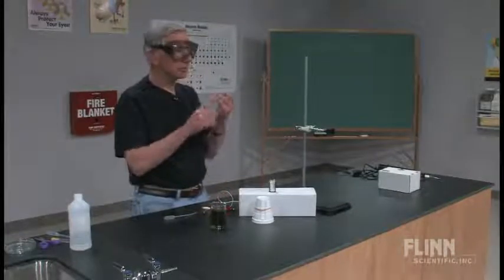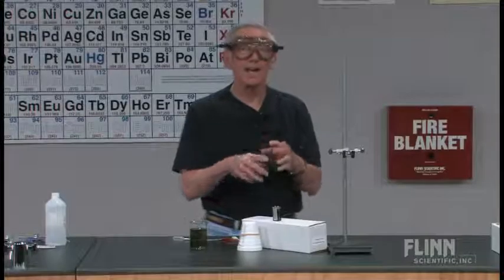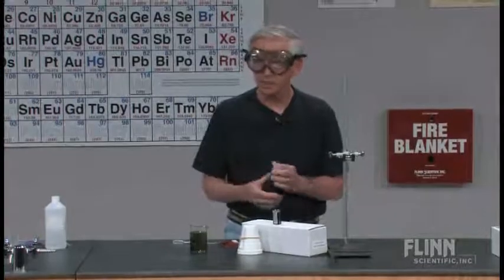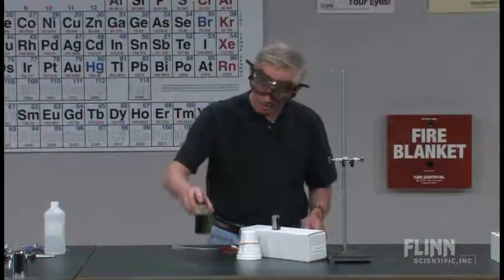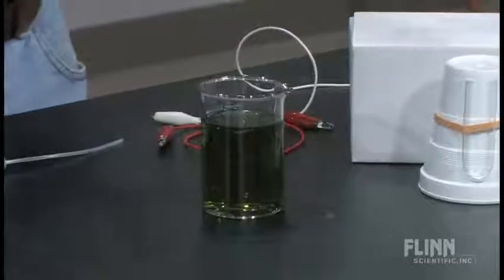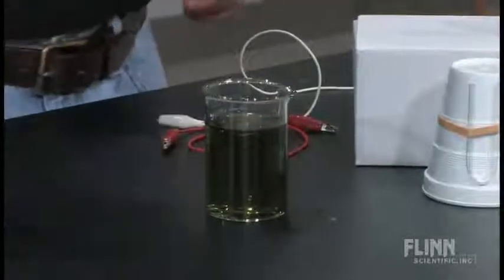It has mostly water, some sodium sulfate. The sodium sulfate is a strong electrolyte, improves the conductivity, in this case measurably, of the water. You see kind of a greenish cast to the solution because I have bromothymol blue in it. Bromothymol blue is blue in base, yellow in acid, so I have approximately a neutral solution.